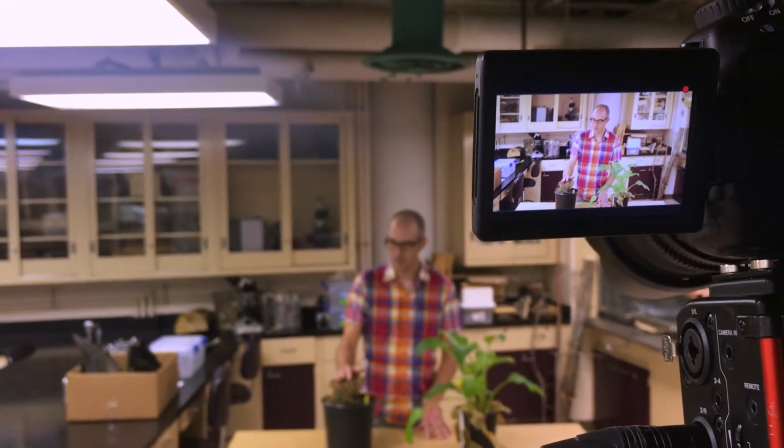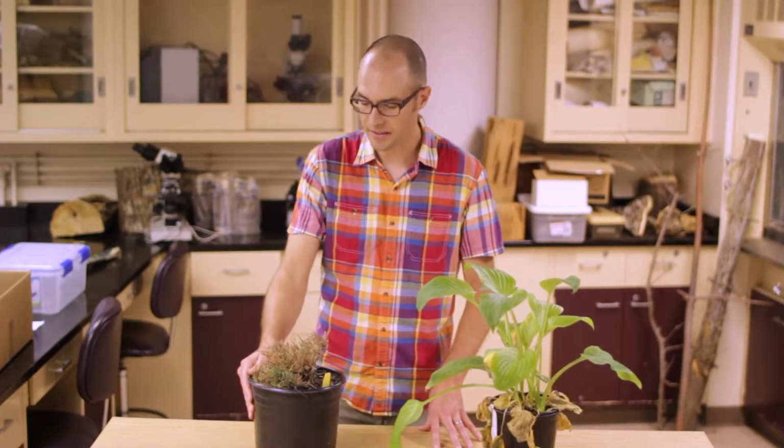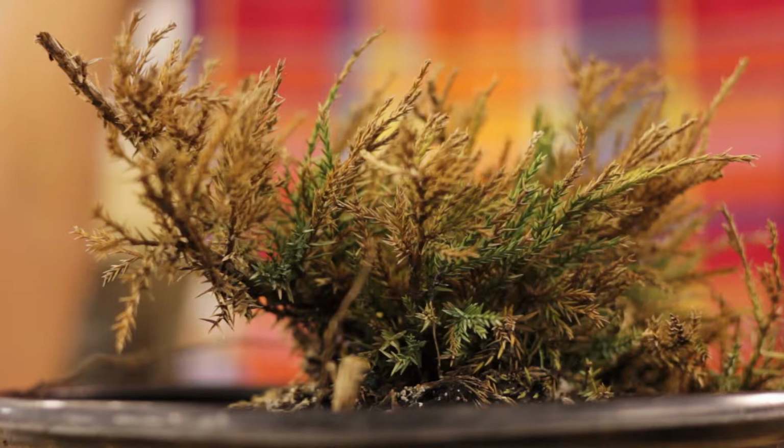So what we have here are a couple different plant samples which were submitted to the Plant Disease Clinic. We have a juniper here and a hosta, and these are high-quality samples, not in the sense that they're healthy, because they're obviously not, but in the sense that they have a lot of tissues that we can work with when we make our diagnostics. They contain both living and dead tissues.